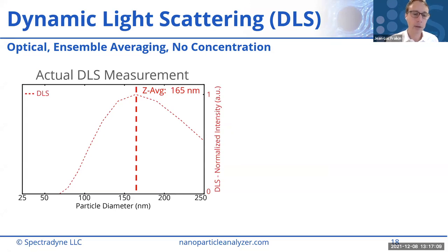And so if I'm an LNP scientist developing a formulation, I'm thinking, hey, this looks pretty good. I've got a distribution that seems to imply a well-controlled size distribution of particles centered around 165 nanometers. I'd like them to be a bit smaller so they can diffuse faster in vivo, but this is a good starting point. And I'd be tempted to use this scattering intensity distribution as a metric for the development of my product. I can push the size down, maybe.